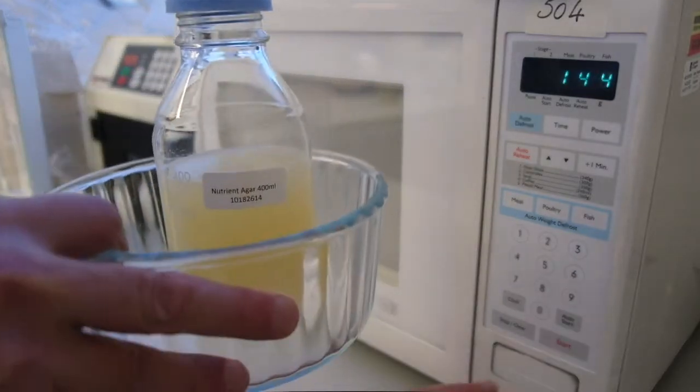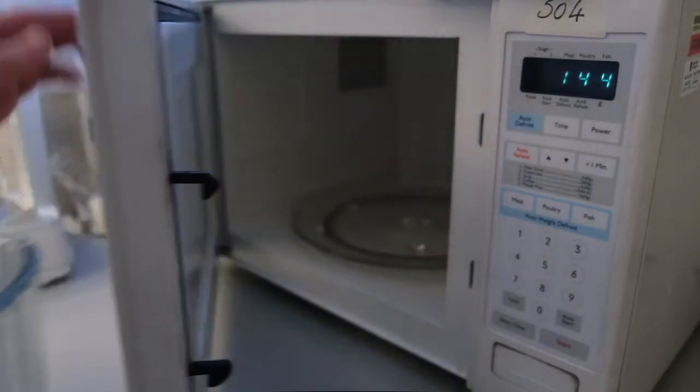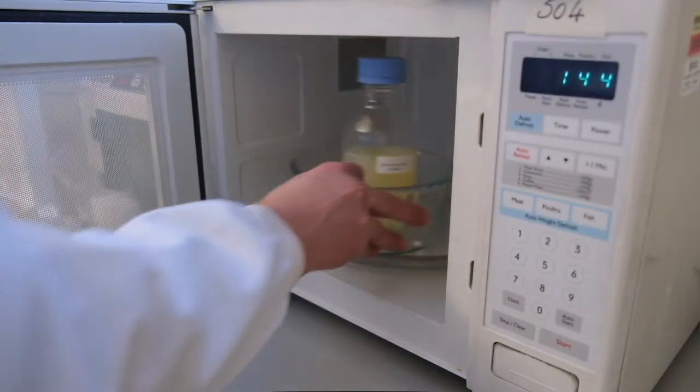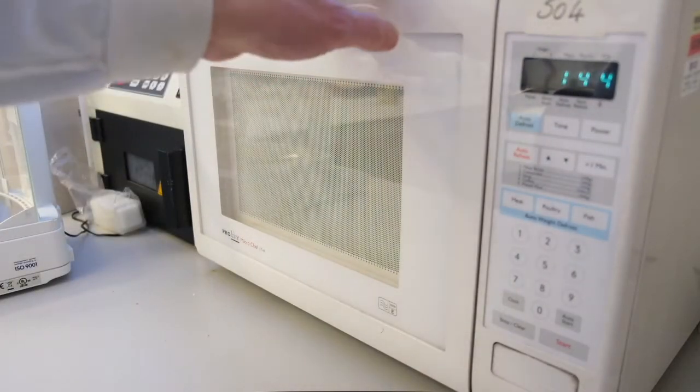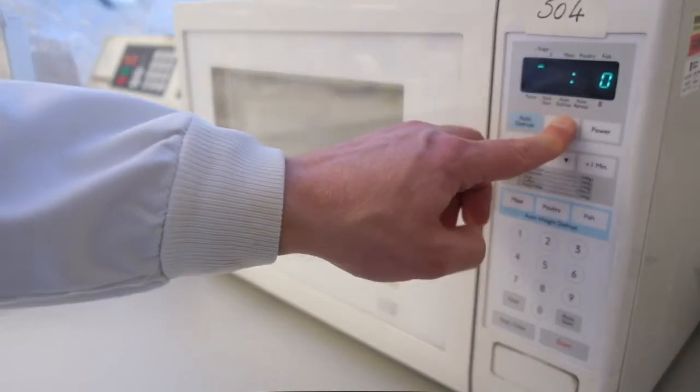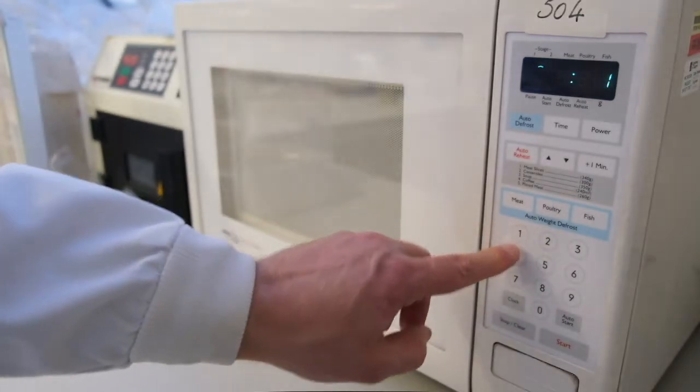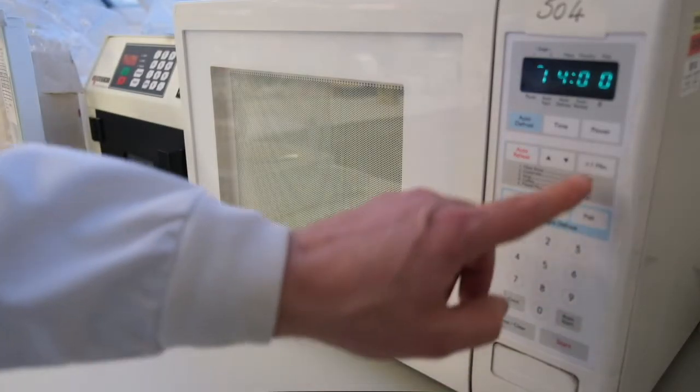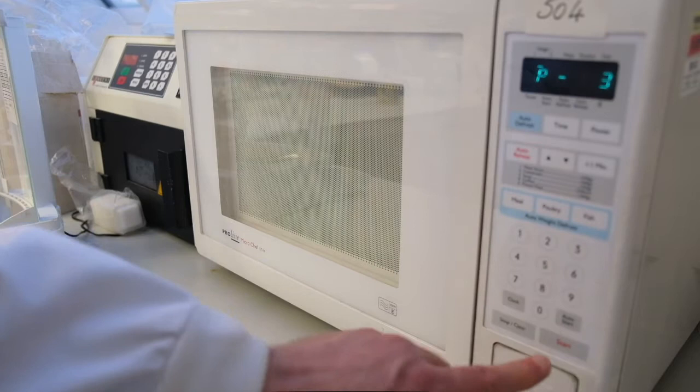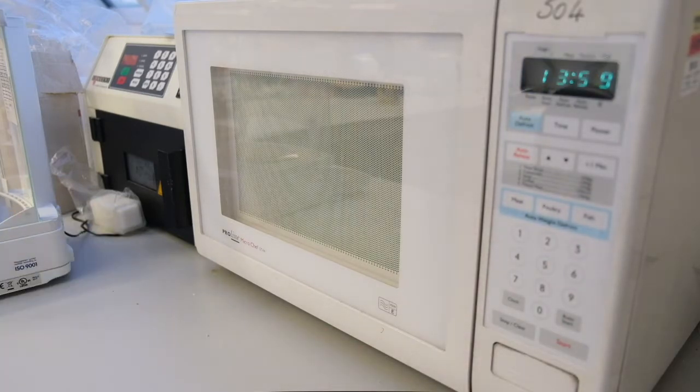We can now place the bottle in the microwave. The glass tray catches any spills. We set the microwave for 14 minutes at 30% of full power. Do not use a higher power or the agar might boil over.